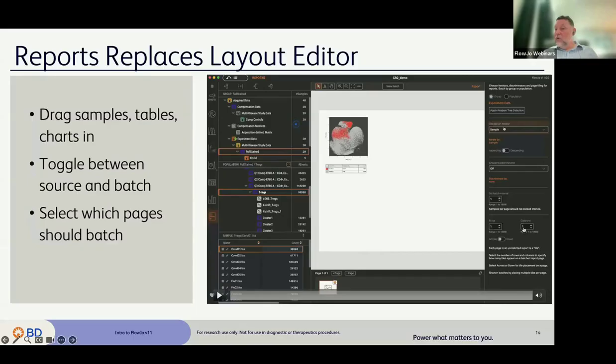I would choose the number of rows and columns that I want to display and choose whether I batch through this group across or down. So in this case, I might go, I want 4 rows by 5 columns, and I want to batch across because I've got 5 patients times 4 conditions. And that would give me a nice tiling of that plot, with rows being the different conditions and columns being the different patients plots, right, from those conditions. Again, I'll show that to you in a moment, but I'm just going to click the video here.